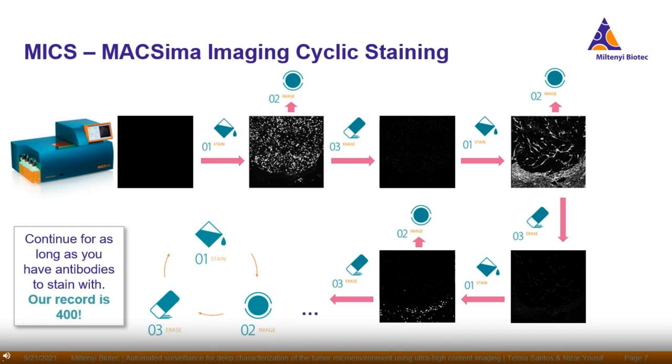Actually, we don't even know what the limit is. You can continue as long as you have antibodies to stain with. Our current record was 400 because we had 400 in our hands. And it's quite impressive, I must say.